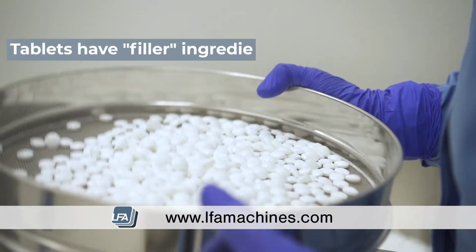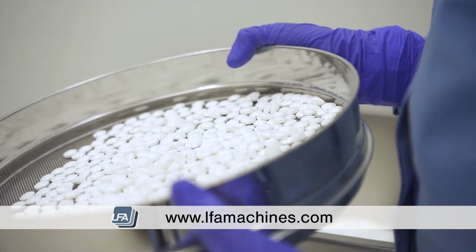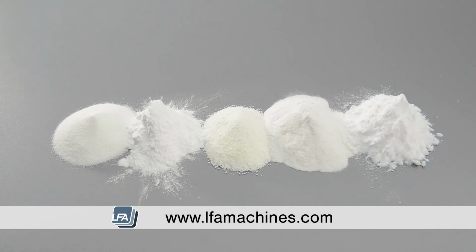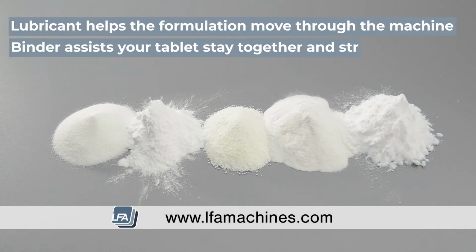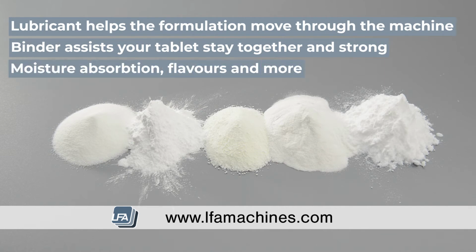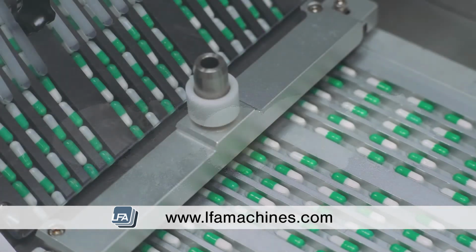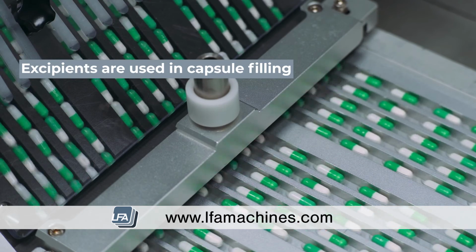A question that often comes up is, tablets have filler ingredients, so capsules are better. When tableting, each ingredient or excipient in a tablet will suit its purpose. A lubricant helps your mix move through the machine, a binder helps keep your tablet from crumbling, producing a strong tablet, whilst others absorb moisture. You'll find some of those ingredients in capsules, as the powder still has to move through the machine smoothly.